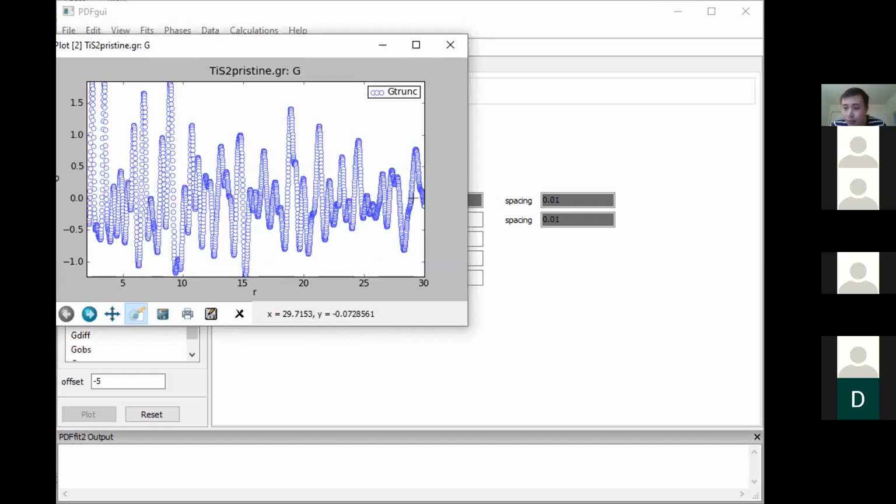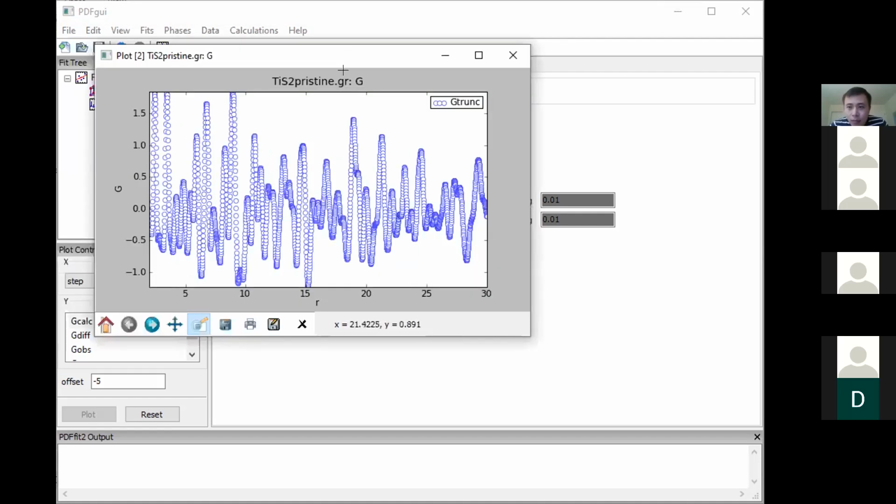Yuan, yep. Can I ask a simple question here? Yeah. Could you please take an example for the doping here? What kind of case would we want to use this doping parameter?